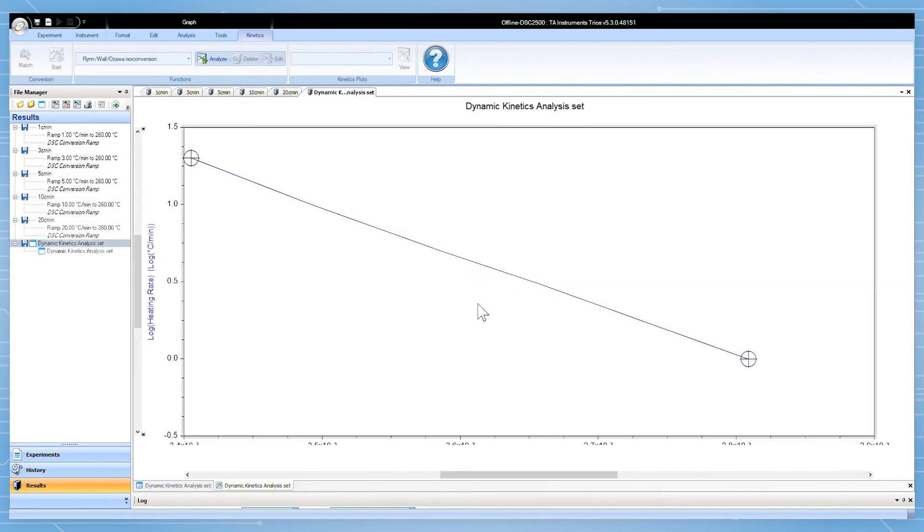This model assumes a first-order reaction. In this case we get a nice straight line from the five experiments, which is a good indication about our data.